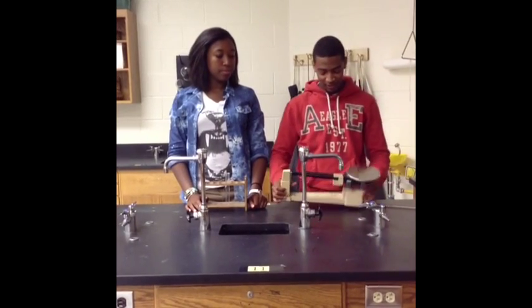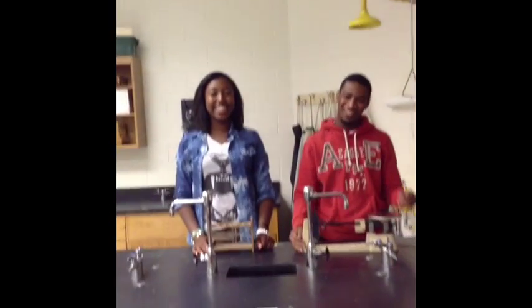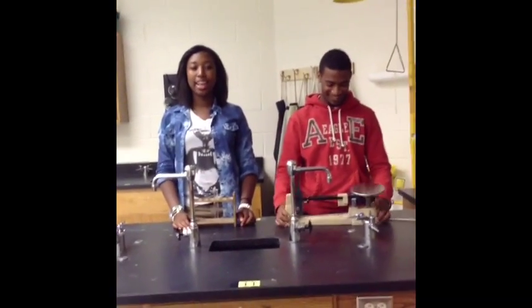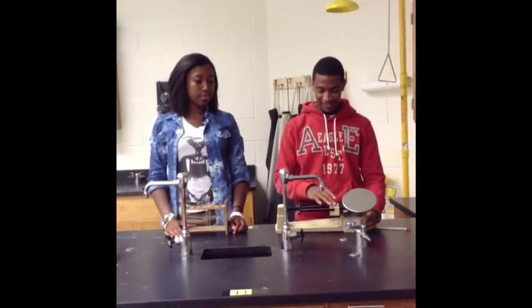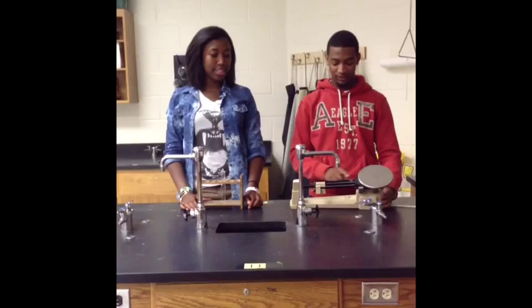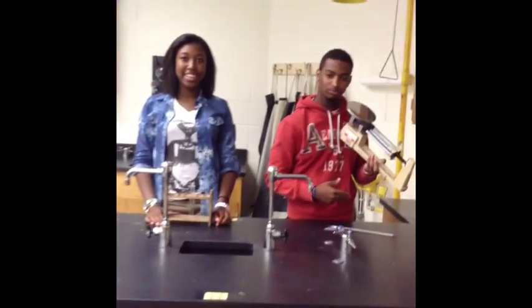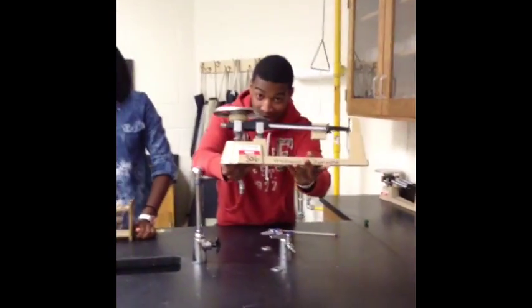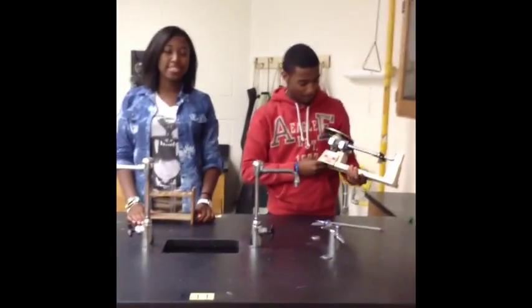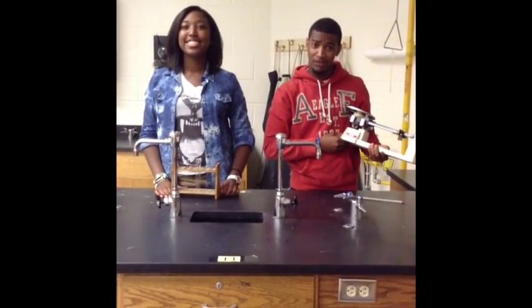We also have the triple beam balance. It measures in the hundreds, tenths, and ones. Come take a closer look at the triple beam balance. Pretty nice. Thank you. Those are all the equipment — be safe out there, guys.